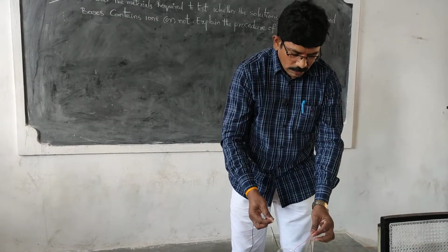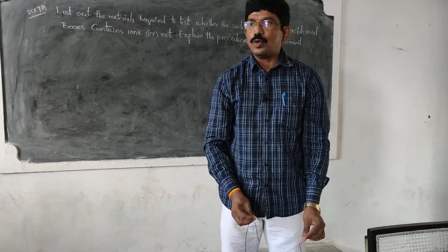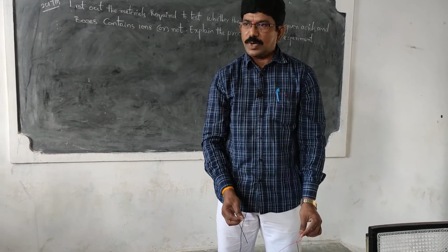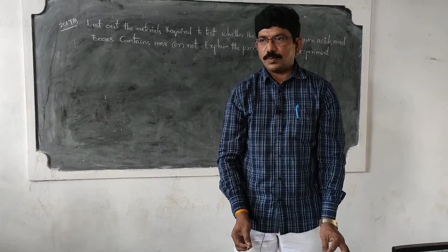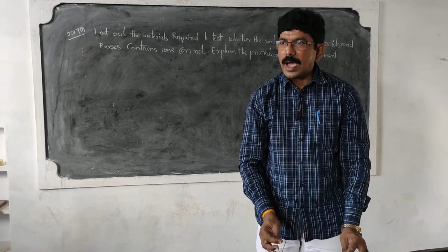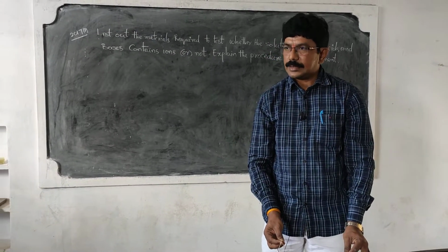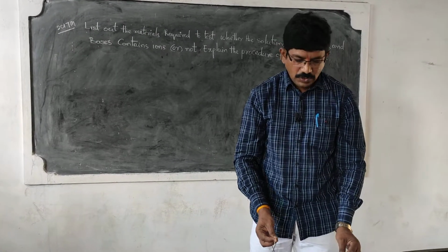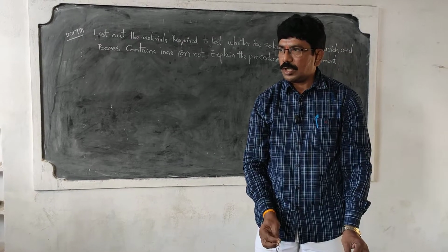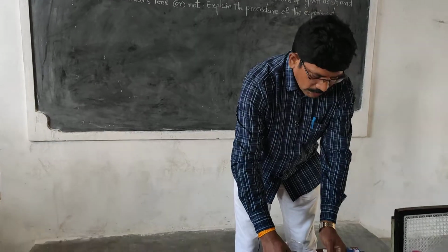If you do this experiment with sugar solution also, it does not allow the current to pass through it, because sugar solution doesn't have H plus ions. It does not split into ions. Those substances which split into ions in their aqueous solutions only conduct electricity. Are you clear? If you take salt solution, it also allows the current to pass through it.